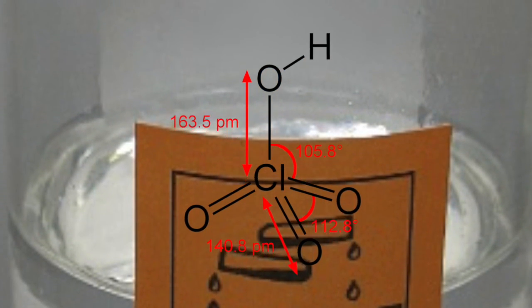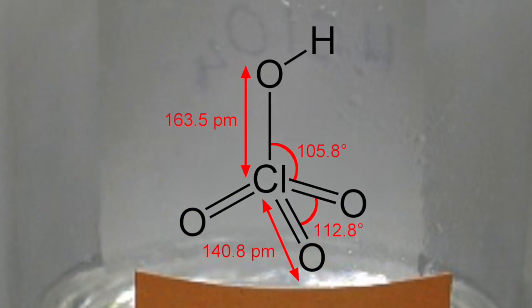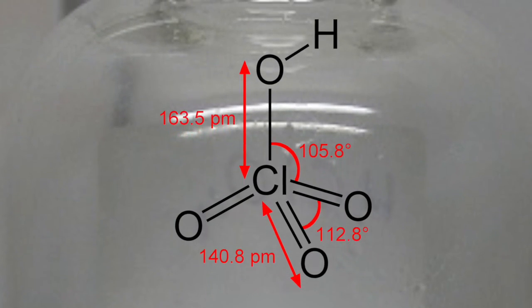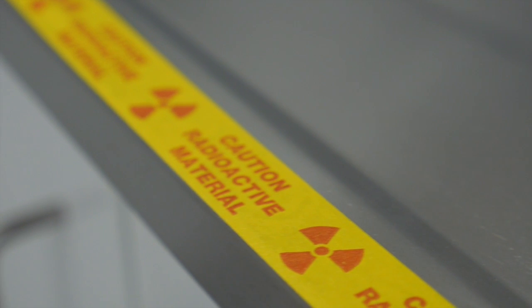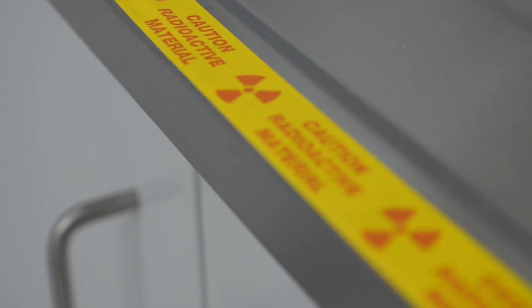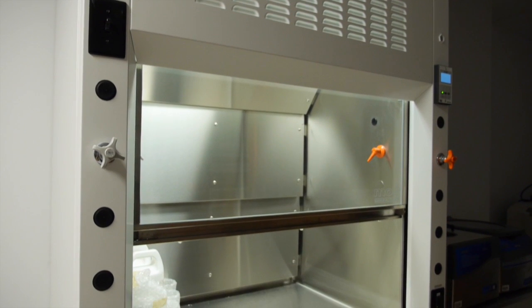Perchloric acid fume hoods are designed with special construction materials and washdown systems. Washdown systems are important to prevent the buildup of explosive perchlorate salt deposits. Do not use radioisotopes in conventional fume hoods. These fume hoods are designed with special construction material for ease of decontamination and to withstand the weight of lead shielding plates.